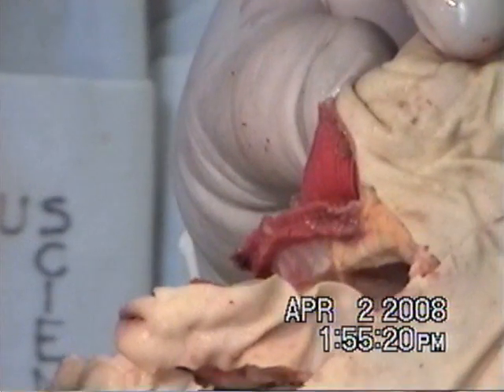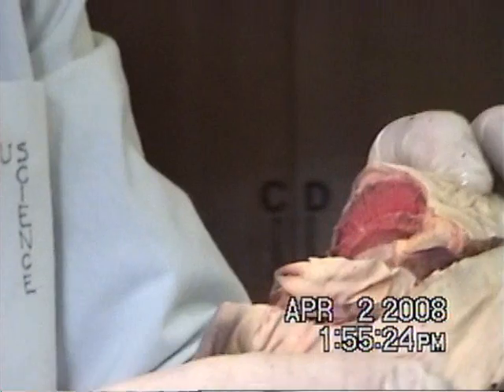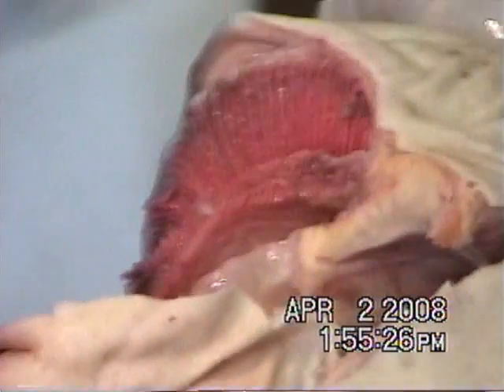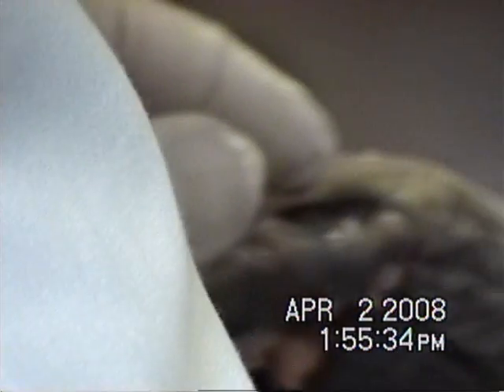Gills — cilia. Very nice gills. Yes, they're ciliated. They're thin hairs. It's bright pink on the screen right here. It's an amazing pink color. What does that mean? Blood. Yes, a lot of blood in the gills because that's what absorbs the oxygen. The blood is still there.